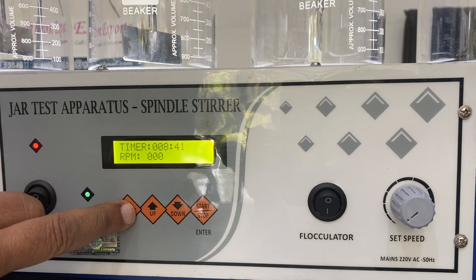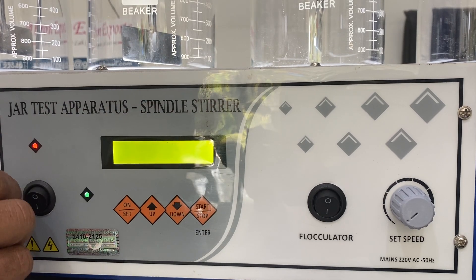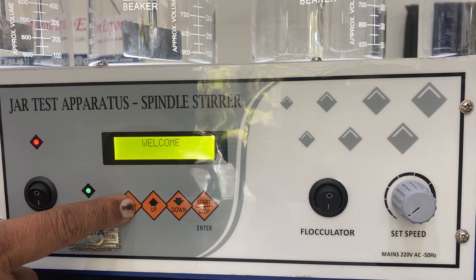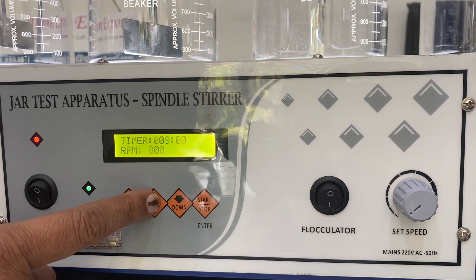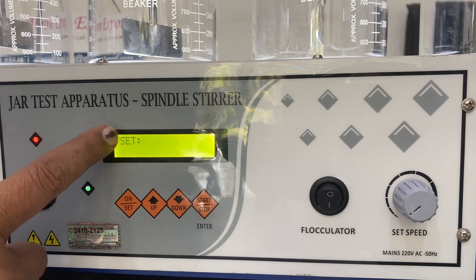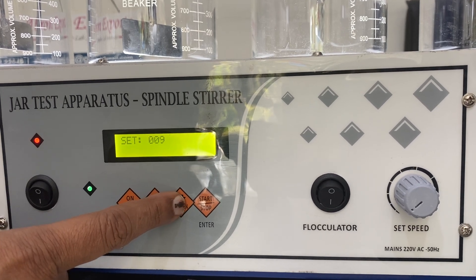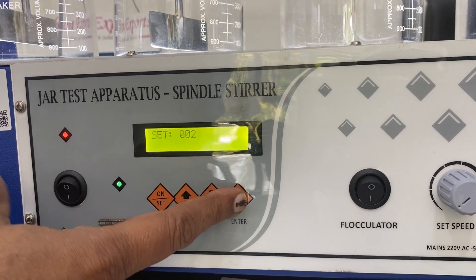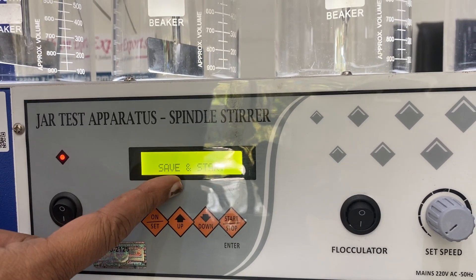Let me show you how to set it again: press it, the welcome screen appears, and then it increases. I can set the time to 10 minutes, or reduce it to two minutes, and then start it — it will work for only two minutes.